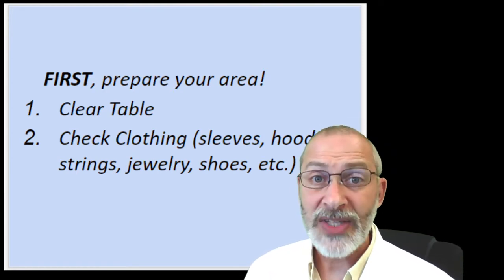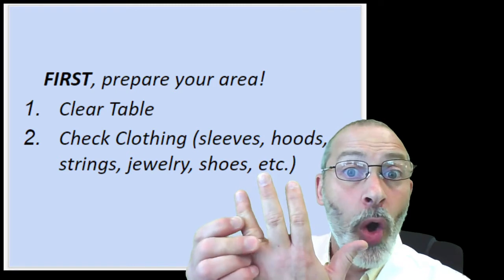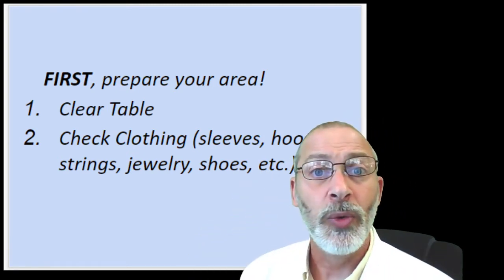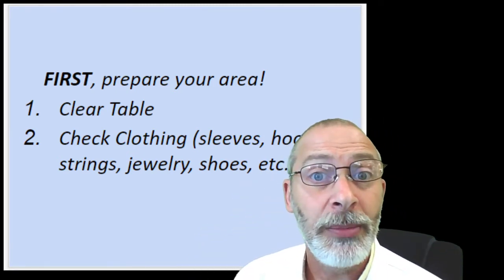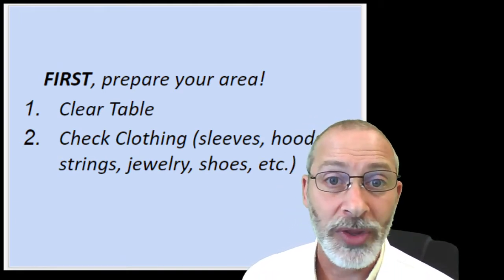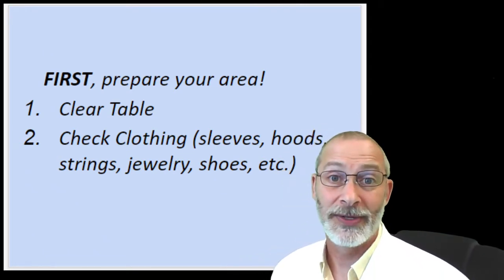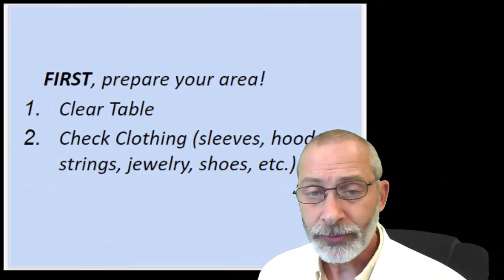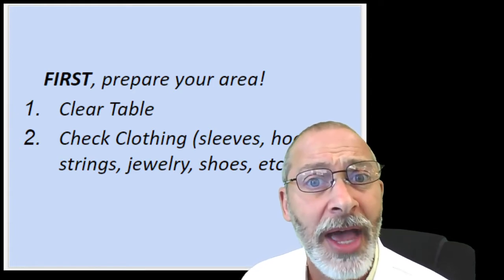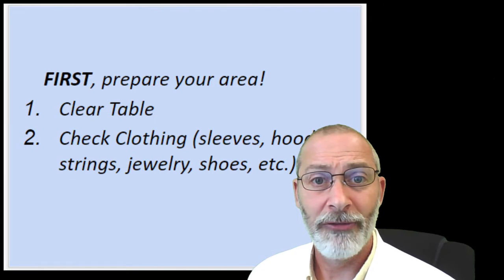Now, the only exception is a wedding band. Wedding band made of gold. Gold, as we will learn in chemistry, is pretty much chemically inert, which means it doesn't chemically react with other things, which is why wedding bands are made out of gold, so that they last a lifetime. So if you've got a wedding band, you can keep that on. But if you don't, all of your other jewelry should be coming off.